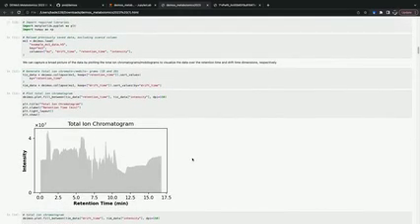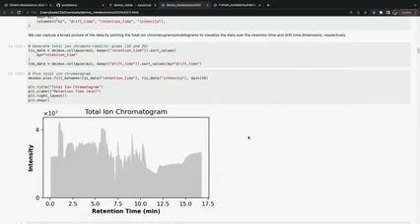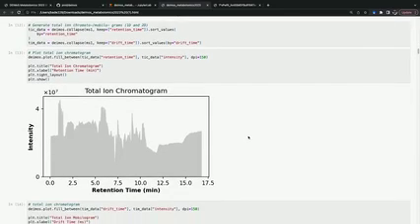And then from there, of course, when you load your data, many spectroscopists like to visualize their data as total ion chromatograms or mobilograms, just so you can get a broad picture of what your data look like. And so here we're using DEIMoS to produce those total ion slices of the data using this DEIMoS.collapse utility. What that does is collapse all the data into the specified dimension. And so here, I guess I'll make it a little bigger. Here we're collapsing in the retention time dimension for that chromatogram and just using DEIMoS' plotting utilities to plot what that looks like here.